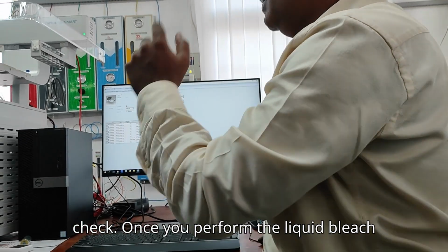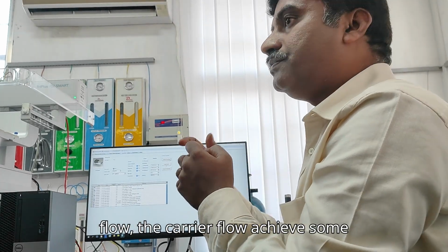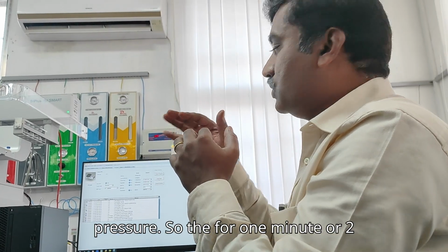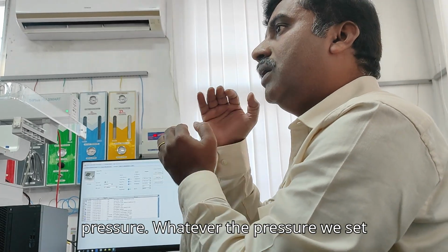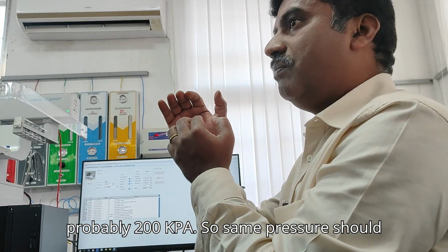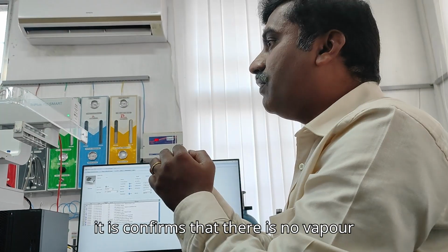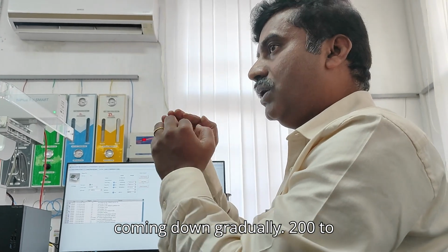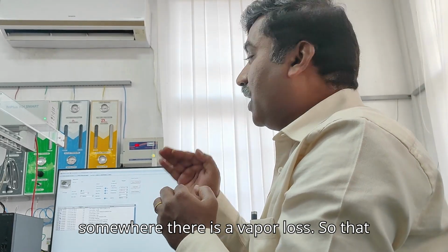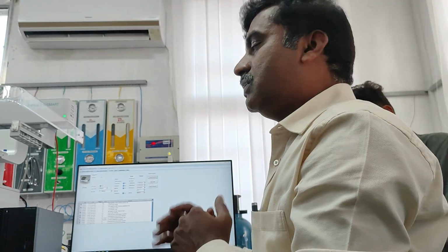Once you perform the leak check, the other end of the column should be blocked so the carrier flow achieves some pressure. For 1 minute or 2 minutes, the column should hold that pressure, whatever pressure we set, probably 200 kPa. The same pressure should be held for 1 or 2 minutes. Then it confirms that there is no vapor loss or carrier loss. If the pressure is coming down gradually, 200 to 190, 180, 170, like that, somewhere there is a vapor loss. So that gives you the confirmation of the proper fixation of your column.